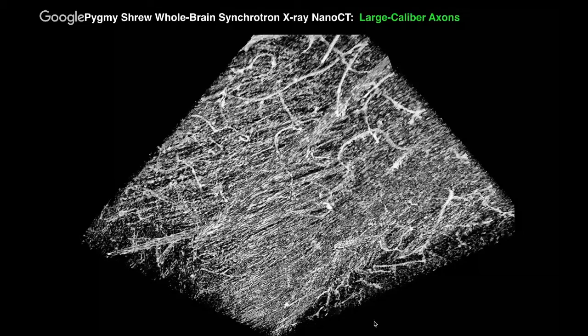And so this is what's currently being investigated now. The resolution is certainly there to permit identification of large axons. And if you can see and trace large axons throughout these entire brains, then while you might not have the complete synaptic level circuit map, what you would have are complete projectomes for various mammalian brains. And this is, I think, very exciting.